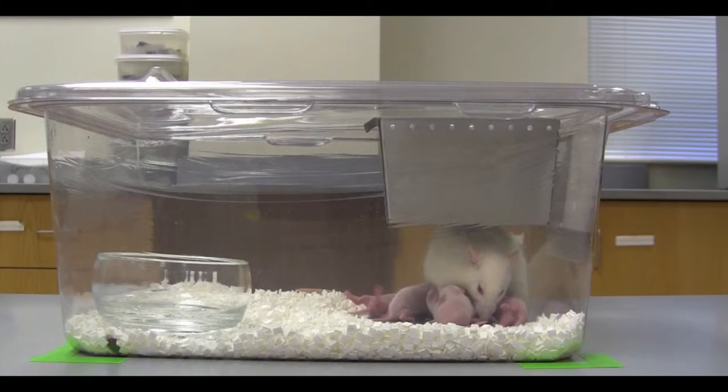The second method for data collection is behavioral analysis, which uses the video footage of maternal rats interacting with their pups to determine the amount of time grooming and the latency period in retrieving the pups.